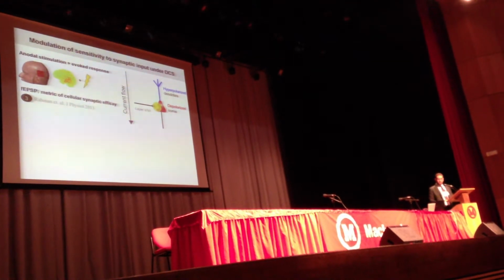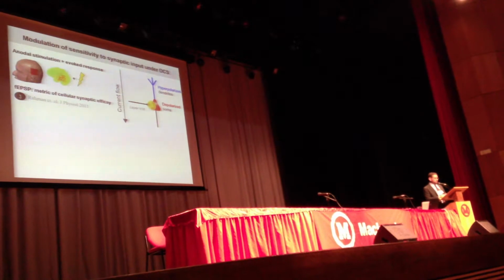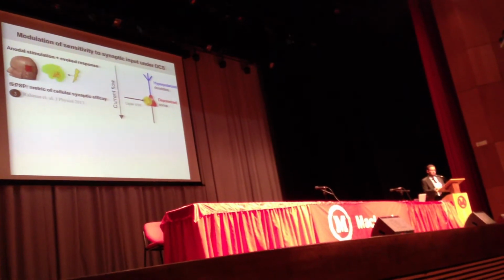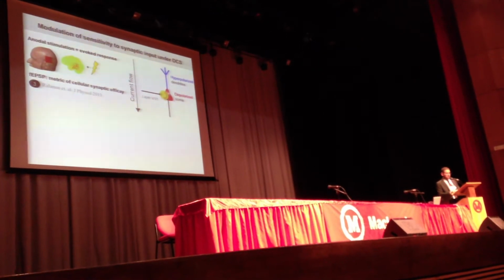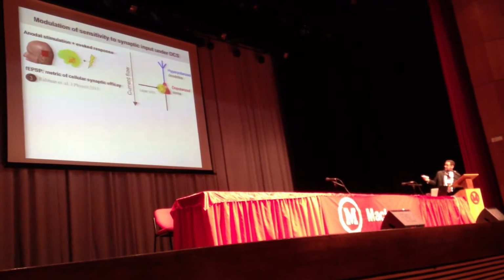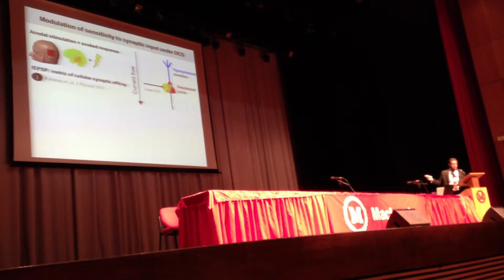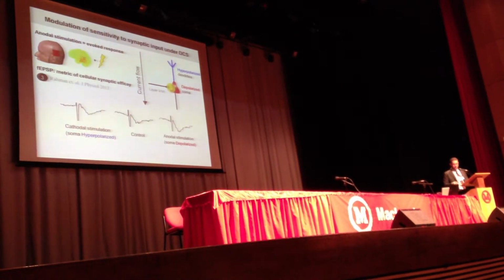Now, we can reproduce this in an animal model with something called field EPSPs. You can also record intracellularly and quantify excitatory postsynaptic potentials. So I'm not talking about firing rate. It's very important to make the distinction here. I'm talking about synaptic strength, how strong things are connected to one another. So if I send the same volley here to an unpolarized cell, or a depolarized soma, or a hyperpolarized soma, how much response will I see?